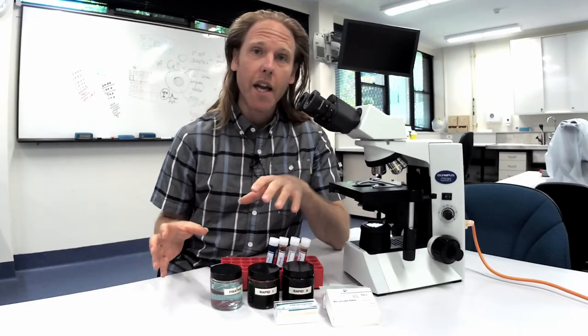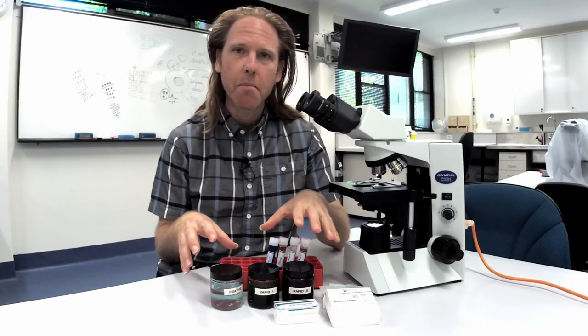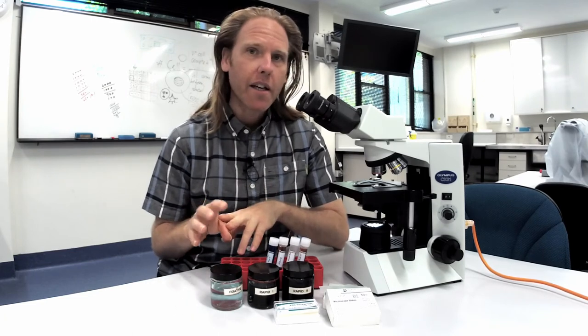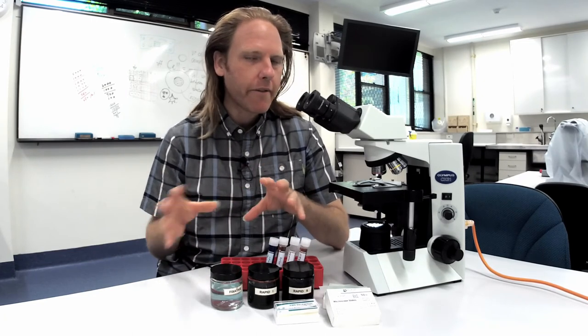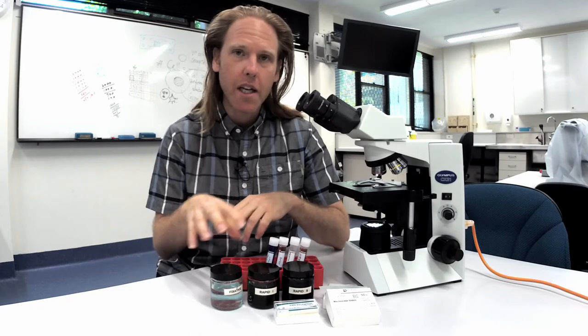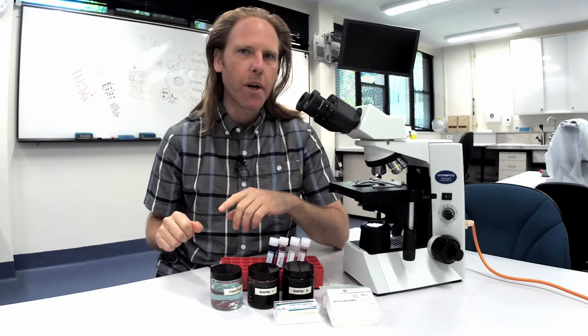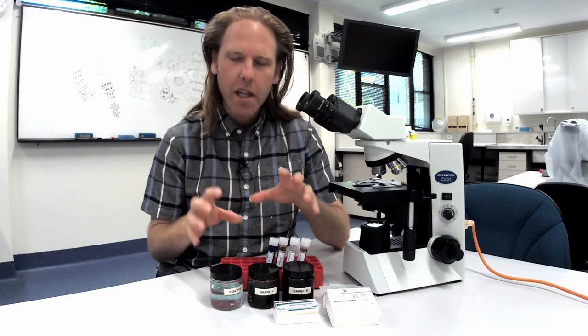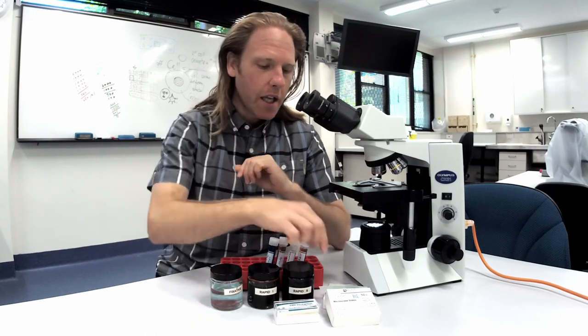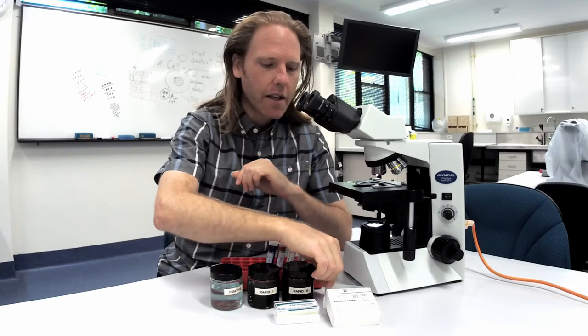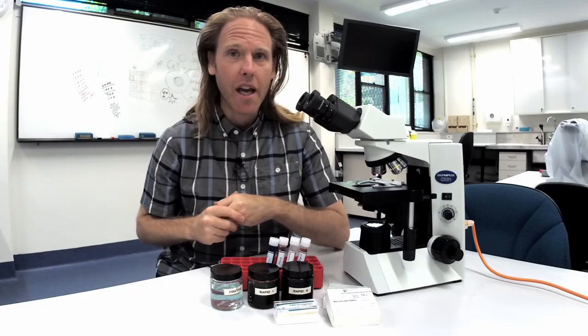Now how often you change the stains will depend on how many preparations you make and how dirty the preparations are. As a rough guide you can make roughly 50 preparations before you need to change the stains and once a week is generally a good starting point. Now if you think you're seeing bacteria or fungi you can stain up a clean new glass slide to double check or just change the whole stain.